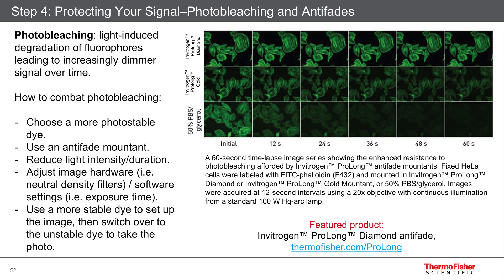Now, a minute doesn't sound like a lot of time, but actually it's quite long for imaging. You need time in order to orient your cells and find what you need without the dye just disappearing. So choosing an antifade is important.